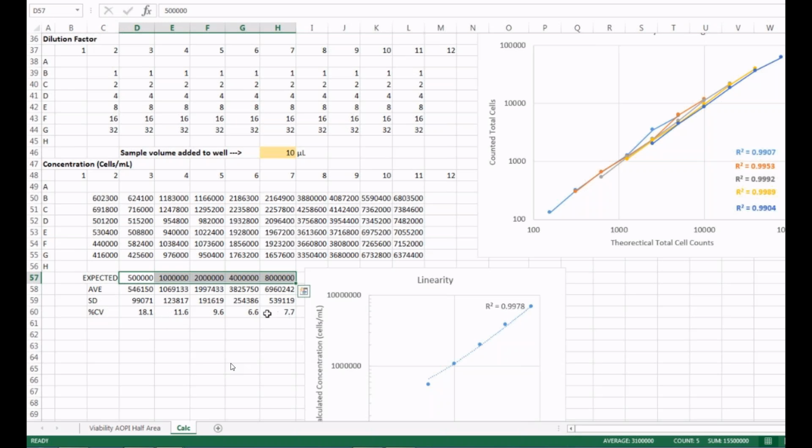And also something you can utilize is the CV. So if you have a large variability in that sample set, basically that might give a little concern that maybe that's the lower end of the sample is too dilute. Maybe we shouldn't use something of that sample dilution factor for that sample size. So once you eliminate that, you can see how the CV goes up for that lower end. So it might be too dilute for those lower concentrations.